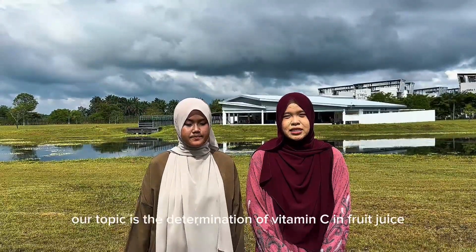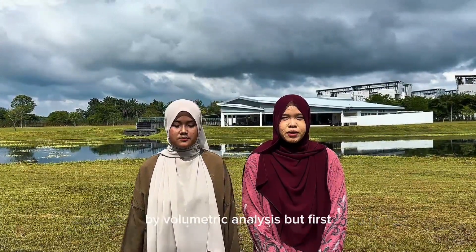Everyone, our topic is the determination of vitamin C in fruit juice by volumetric analysis.